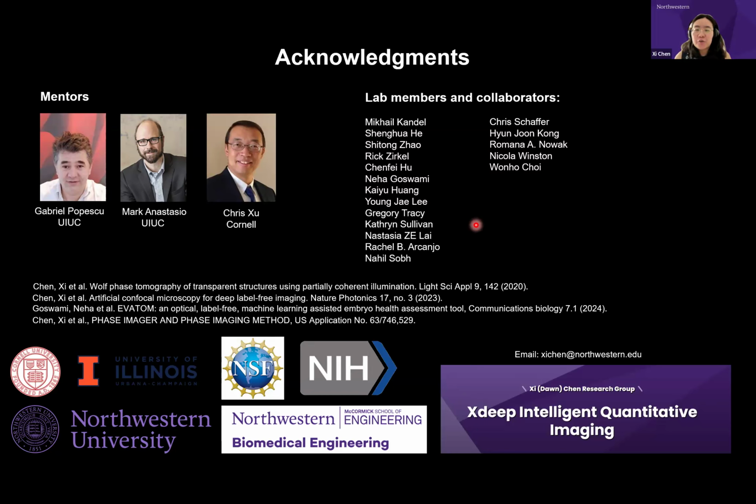So far, I have not imaged muscle. Actually, we did image one muscle, the muscle on the mouse leg. We did image it once, and I think that was using the visible light modality, the QPI modality. And for all the visible light, it's limited to about 100-ish microns, depending on the sample, of course. For the muscle, I think only the shallow region. It's mainly because of the skin.